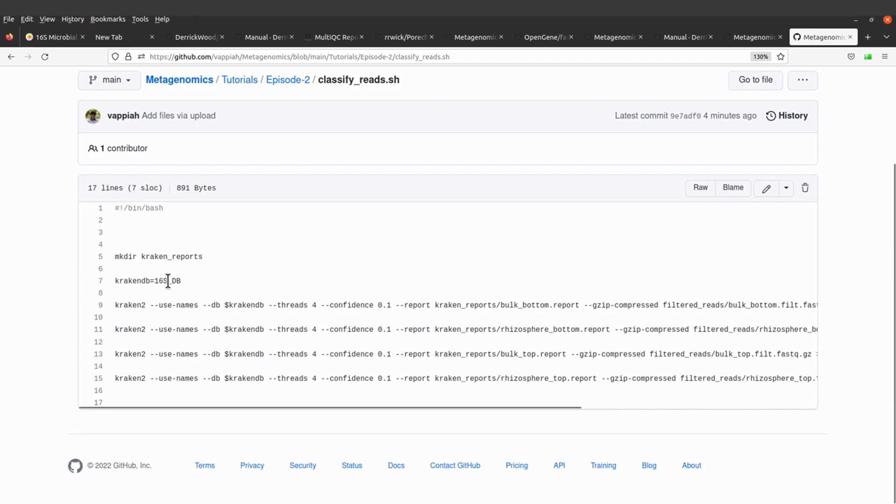We have also defined the database that we are going to use—that's the 16S DB—and we have the commands here. There are four commands, one for each file.